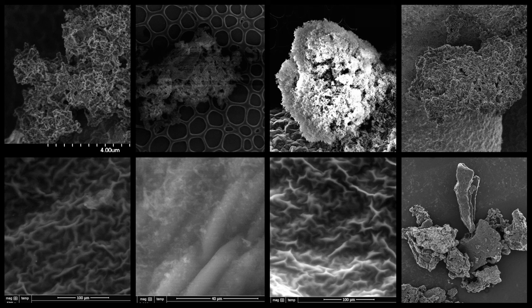I would implore you to keep SEM in mind as you consider projects in the next term. In the course and previous years, we have used SEM and ESEM to a significant degree. Last year alone, I was involved with a few of the projects, taking pictures of leaf stomata, chemically modified sponges, and nanoparticles used to coat certain brass instruments. All of this is possible with an SEM in this course. It just depends on the projects you make.